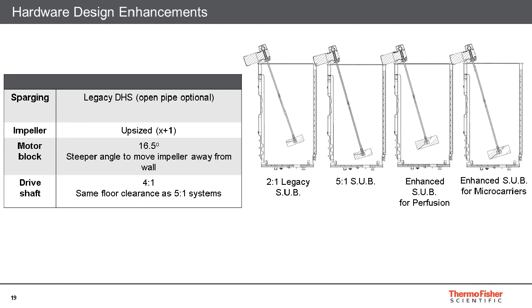On top of that, so that was really the main design change, but not the only one. We'll see that later when it comes to consumables. But when it comes to hardware, we do have a few. We did have in the past a few iterations of our hardware. So in this slide, we just show a little bit what the history of our bioreactor is.